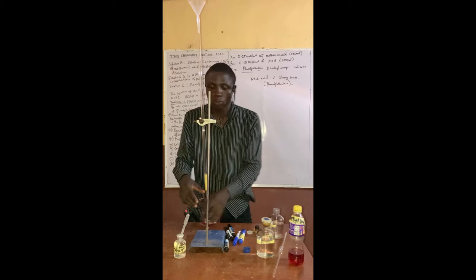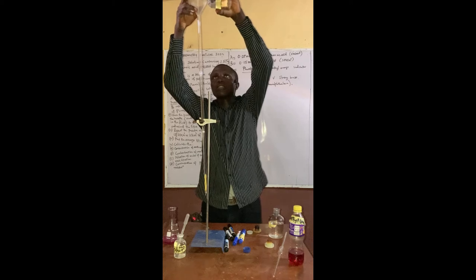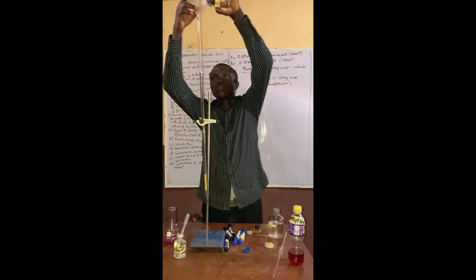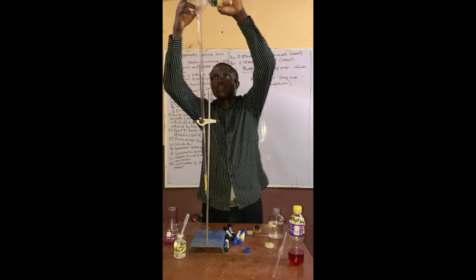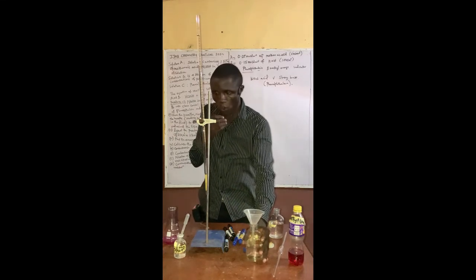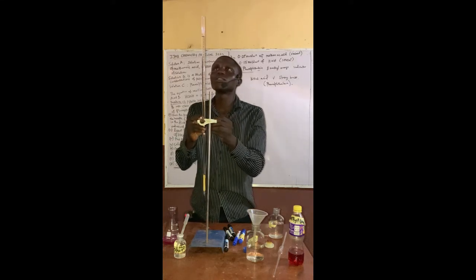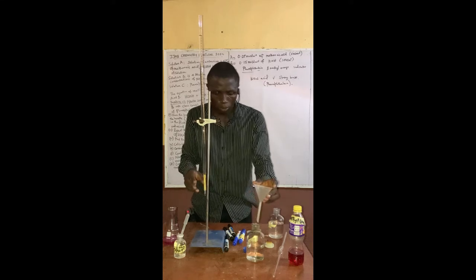So then you release this one. Then let me fill in what? The solution A into the burette. So this is 0 mark, exactly 0 mark. So I don't fill in this one now. Ensure that you have your reading at the meniscus. So you can reduce it if it's too much.